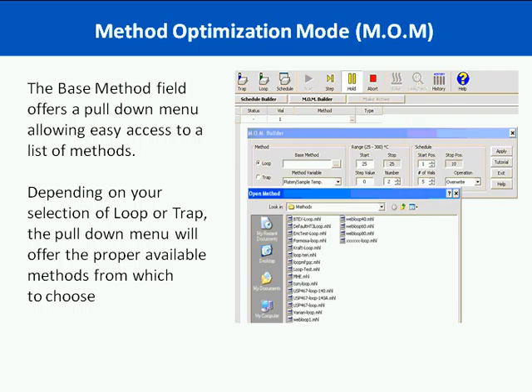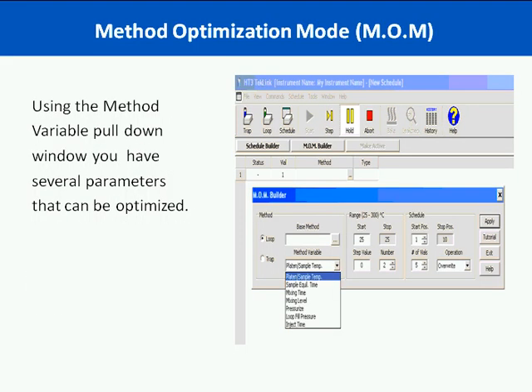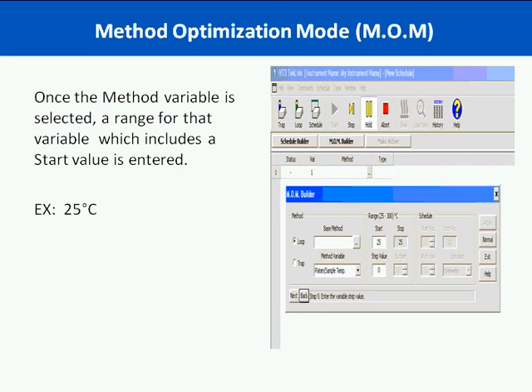A pull-down menu for each field is going to walk you through the steps of the schedule building process. Depending on whether you're running static or dynamic mode, the appropriate methods — which can be your default methods or any previously developed methods — are made available for you to choose from. Using the method variable pull-down window, you have several parameters you can now optimize. This is an example of the loop method builder where you can vary method variables such as platen sample temperature, sample equilibration time, your mixing time or mixing level, your pressurize time, your loop fill pressure, and even your injection time.